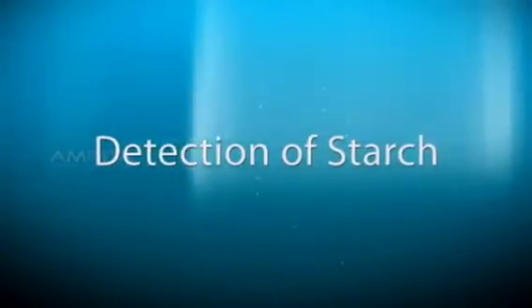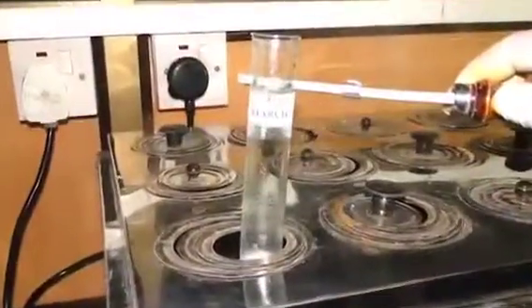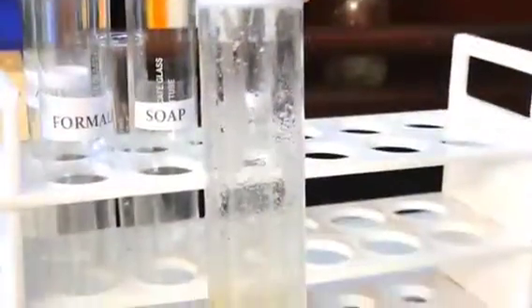Detection of starch. Pour 3 ml milk in a test tube labeled starch. Now place the test tube with the test tube holder in a water bath at 100 degrees Celsius. After 5 minutes, remove the tube from the water bath and allow it to cool. Using a dropper, add 2 to 3 drops of iodine solution to the test tube and shake it well. If the color of the milk solution turns yellow, it indicates the absence of starch. Dark blue color indicates the presence of starch in milk.